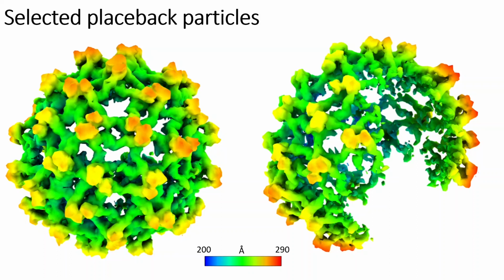If we take just one of the particles, we can nicely see that we only placed back a single spike into our tomogram, yet the orientations and the shifts of them created a very nice net of interconnected spikes, which extremely well corresponds with the low resolution reconstruction from the SPA, because it's also showing you some of the features that were visible on the SPA particles.